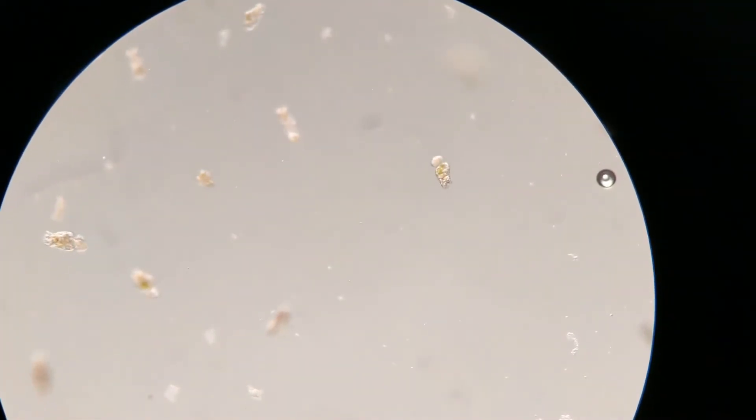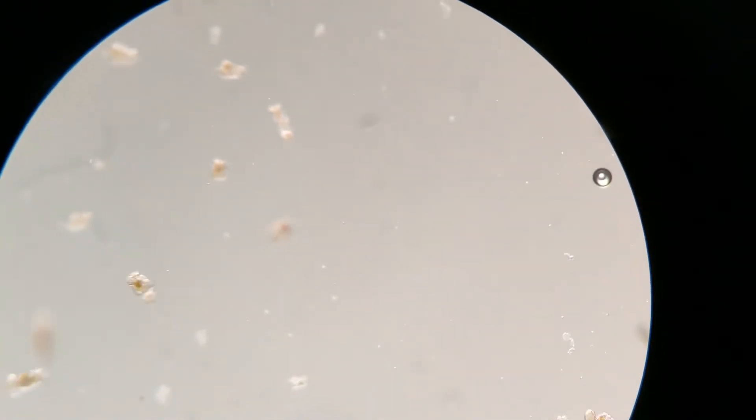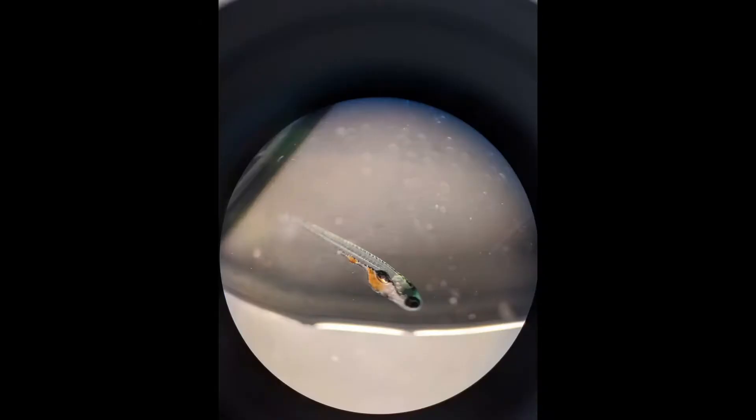We chose to grow rotifers because they are very nutritionally dense, easy to grow, and grow in very dense quantities. This is what a young healthy zebrafish looks like when its belly is full of rotifers and dry food.